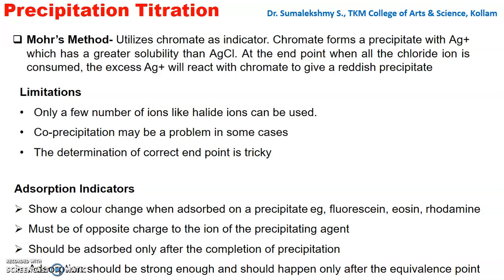The adsorption between the indicator and the complex should be strong, but that should happen only after the equivalence point.